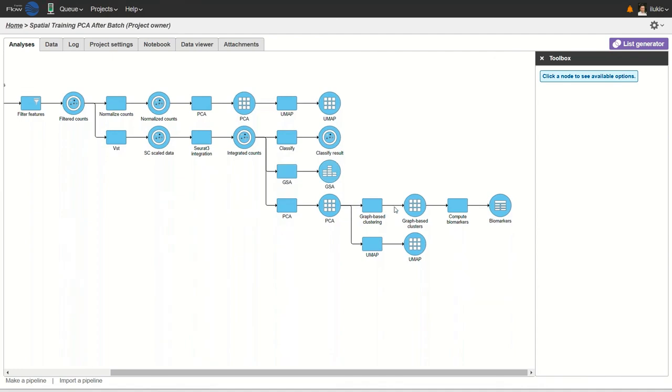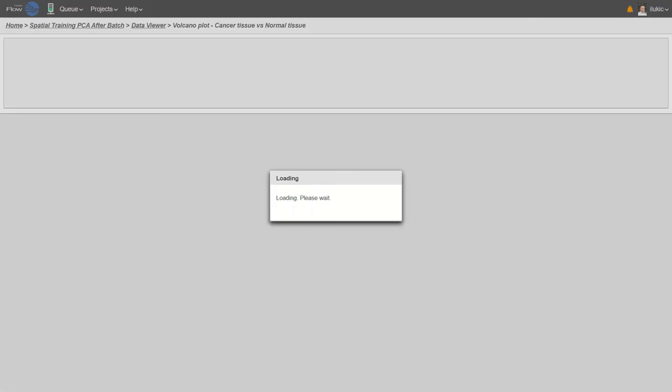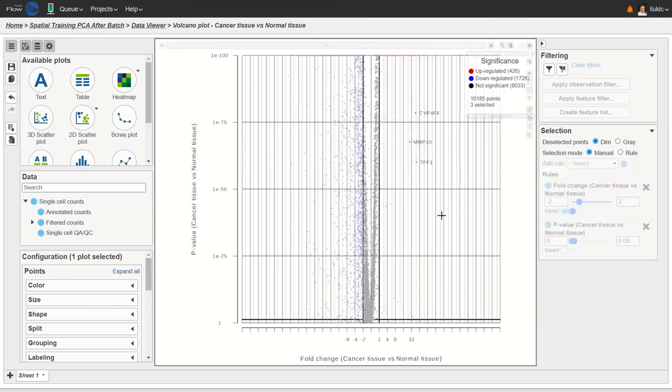And the result is a gene table with genes on rows, and on columns, we get the p-value and the fold change. Now, these two pieces of information can be visualized using a volcano plot. Here's the icon, display volcano plot. Upregulated genes in red, downregulated in blue. Like all our charts, the volcano is also very interactive. For example, you can annotate the genes directly on the volcano.